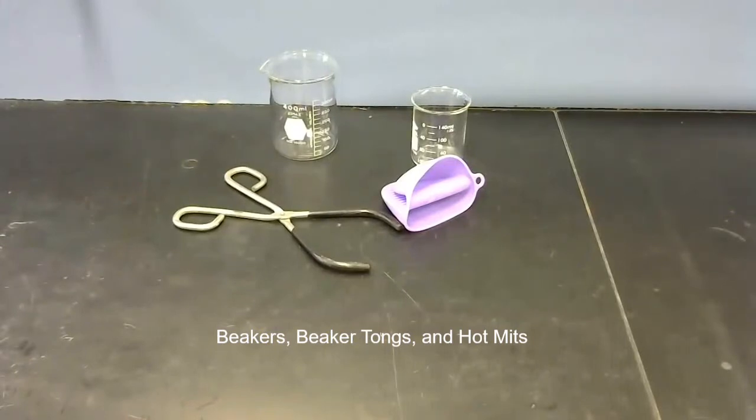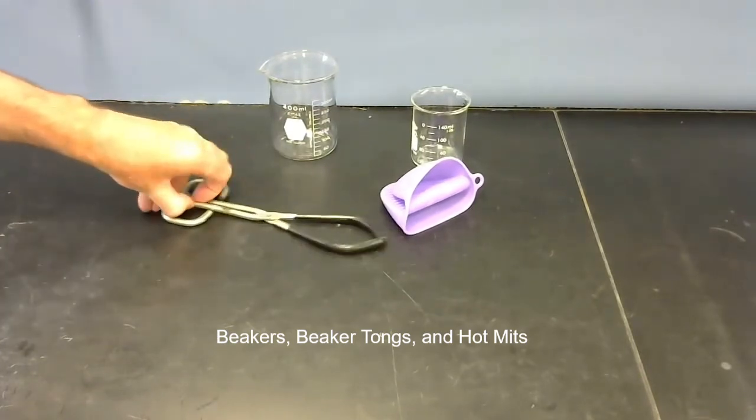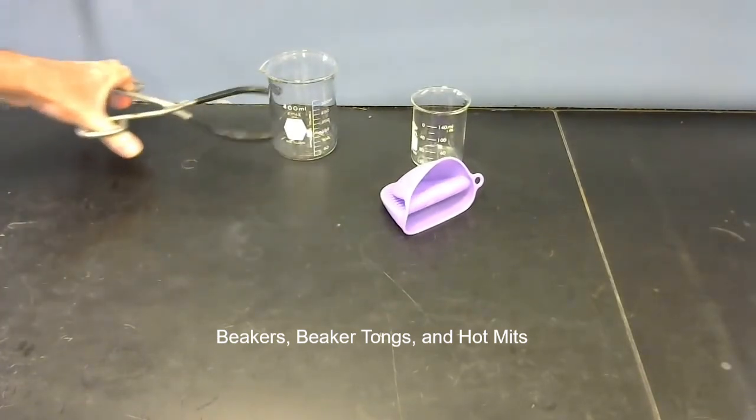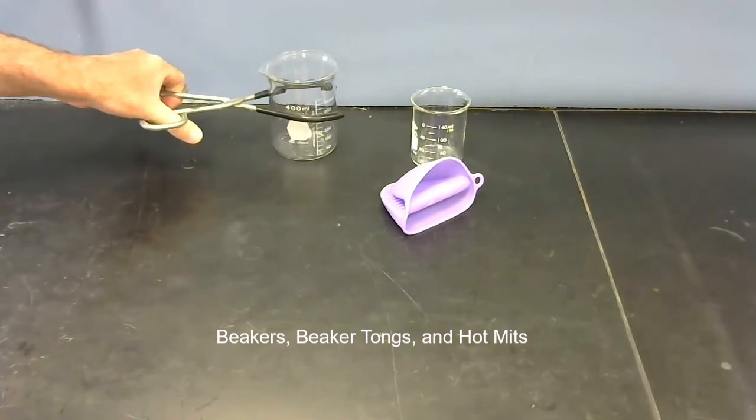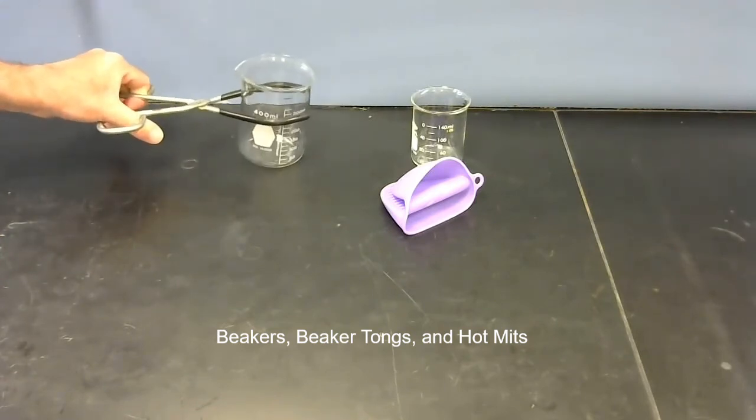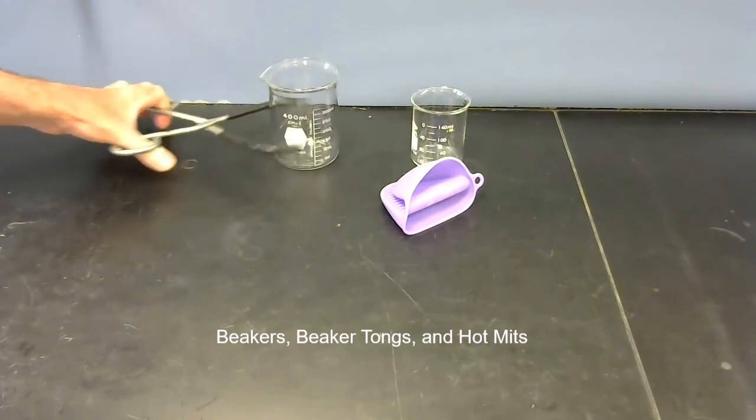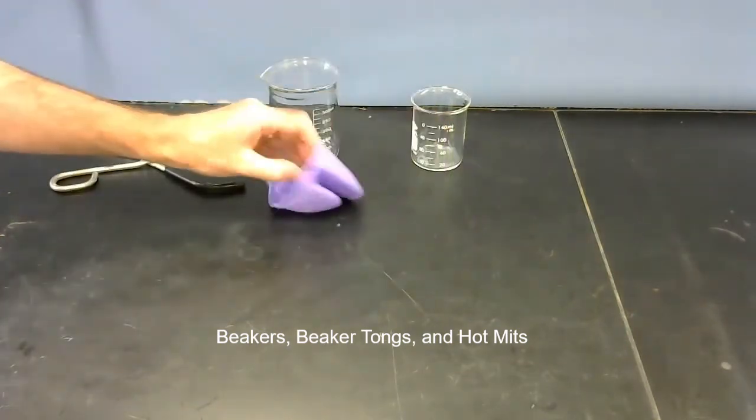These are beakers of different volumes. You've got beaker tongs that you can use if something in the beaker is hot, you can pick it up without burning your hands. Or if it's something smaller, you can use these hot mitts.